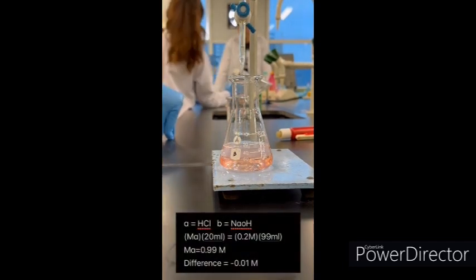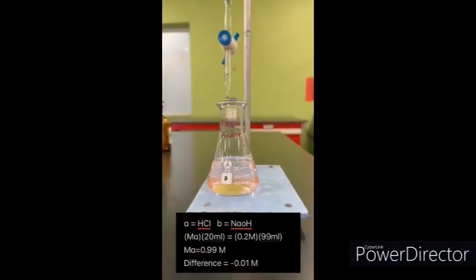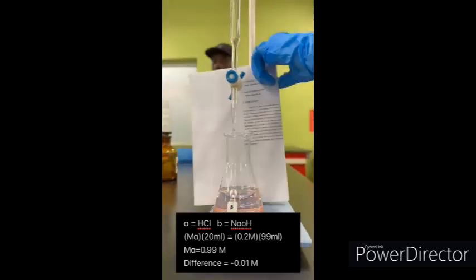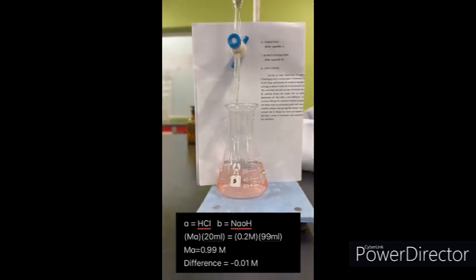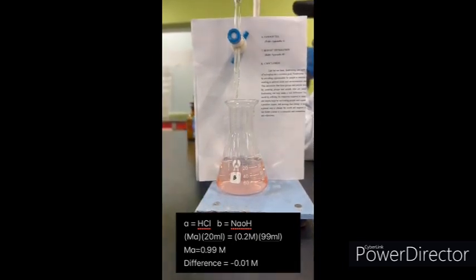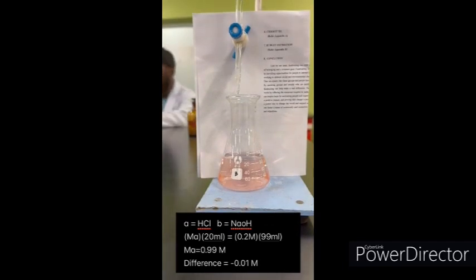Based on the first titration, we used 99 milliliters of sodium hydroxide to achieve the endpoint. And let's say if the hydrochloric acid molarity is unknown, by calculating through the formula MAVA = MBVB, the molarity calculated is 0.99 molar for the hydrochloric acid, which is only 0.01 molar less than the supposed result.